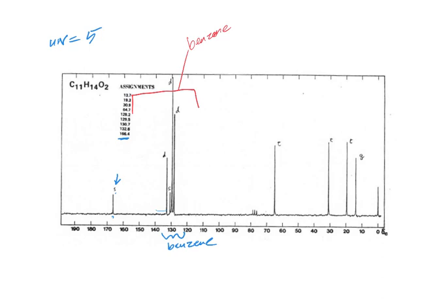Well, where are the ketones? They're over 190, 200. Ketones and aldehydes, even if they're attached to a benzene ring, would be over 190. Okay. So what kind of carbonyls would be more in the 160, 170 range that has 2 oxygens? Carboxylic acid. Possibly a carboxylic acid, or an ester.